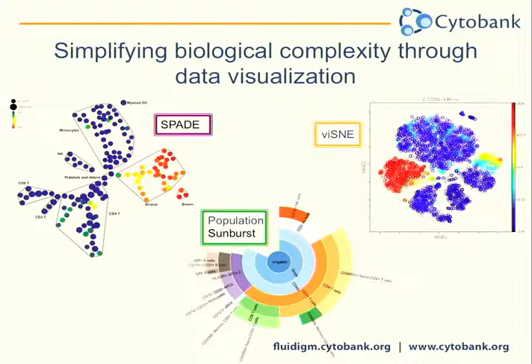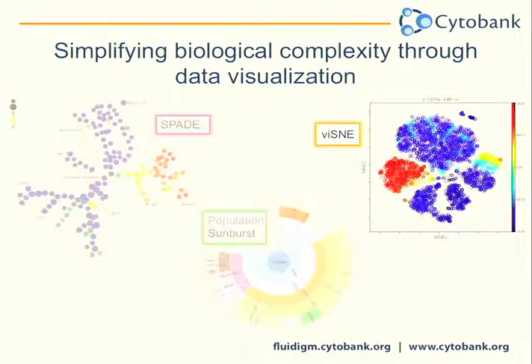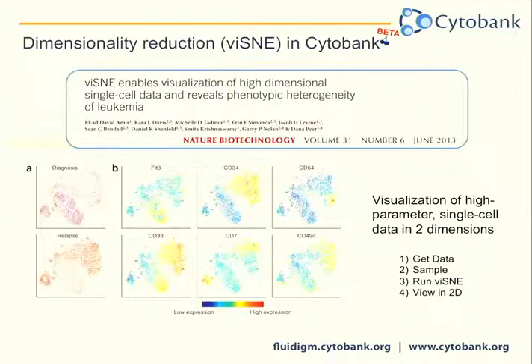The third visualization tool that I'm going to talk about, which we're debuting next month and releasing to our enterprise sites, is viSNE. So you heard a little bit about it earlier today, and you're probably going to see some plots later this afternoon as well. But viSNE is a dimensionality reduction tool.